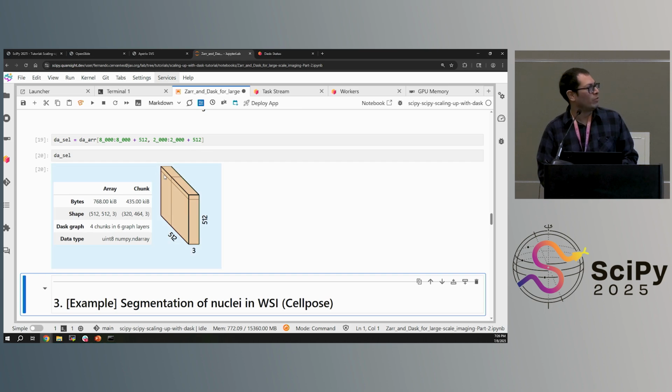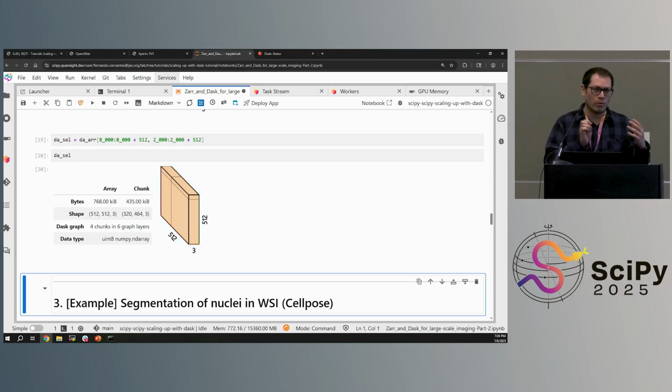So the idea would be an exercise of image analysis. A common pipeline would be to take an image, apply some thresholding algorithm to discriminate between objects that have a certain intensity in the pixels. So that would require to first convert your image from an RGB color image into grayscale.